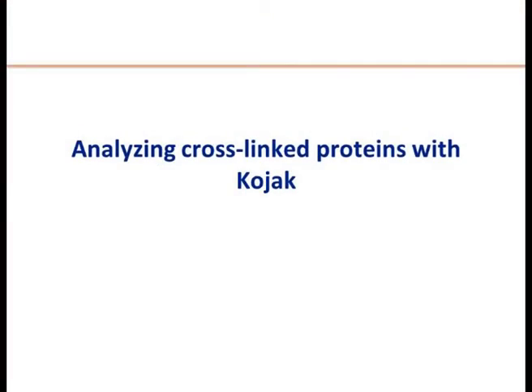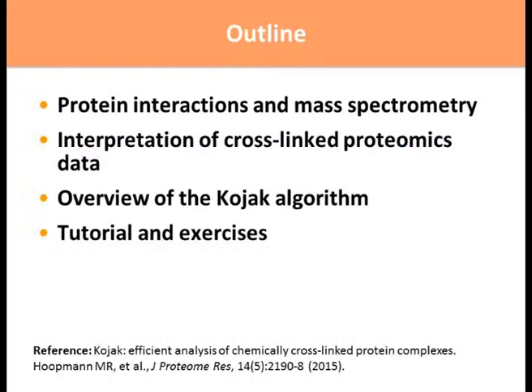And so this is a big departure from my last lecture. But it highlights just some of the latest techniques and some of the most interesting techniques being applied to shotgun mass spectrometry today. And that's going to be analyzing cross-linked proteins.